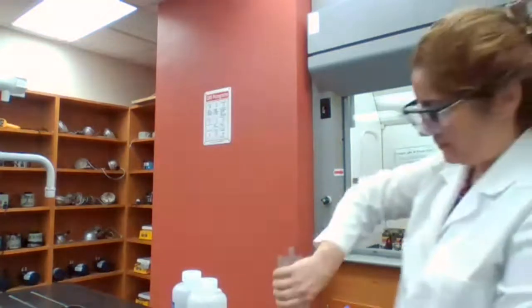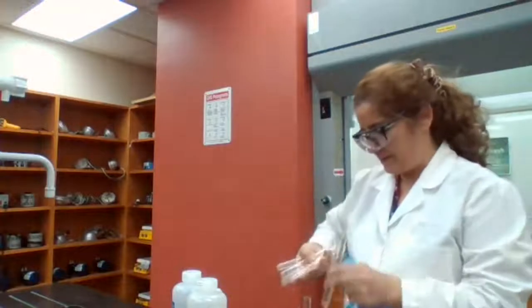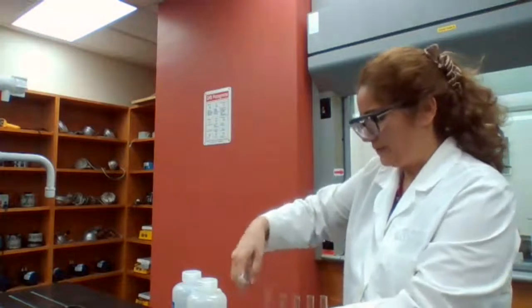I also got some large test tubes because with the 5 milliliter solvent, it's not easy to shake it when it's small test tubes.